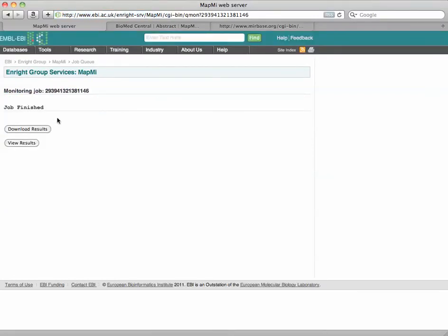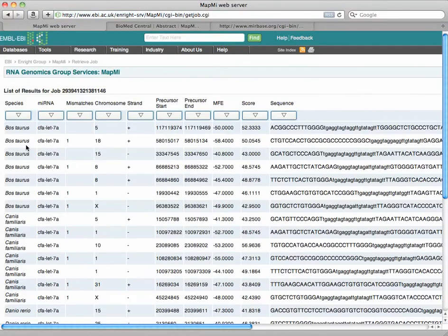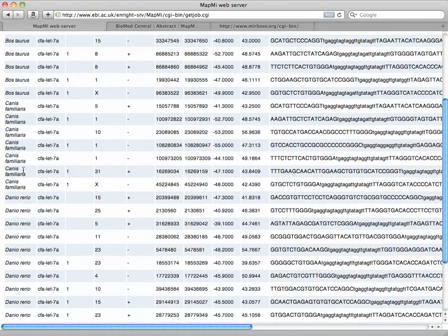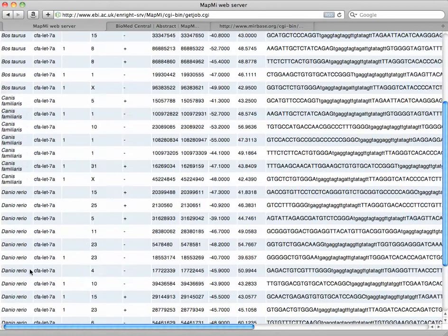And there they are. You can download the results or you can just view them here in the web server. And here, as you see, I pulled out many. I pulled out a lot from cow, from dog, from fish, and one from Drosophila.